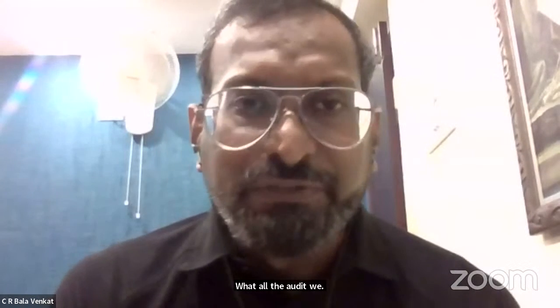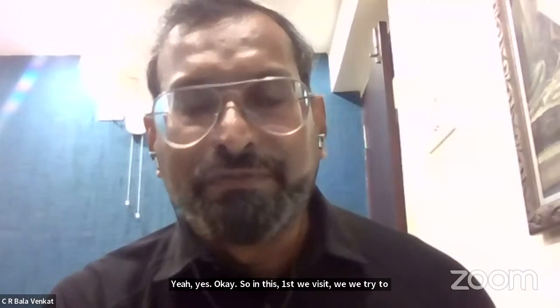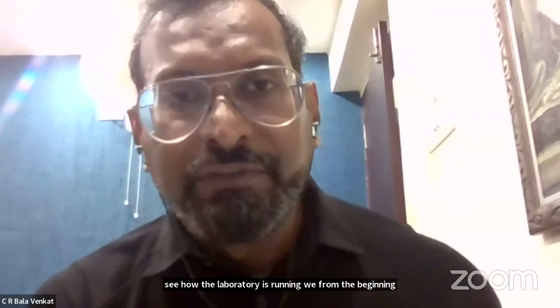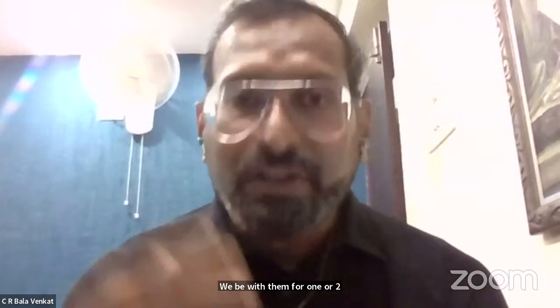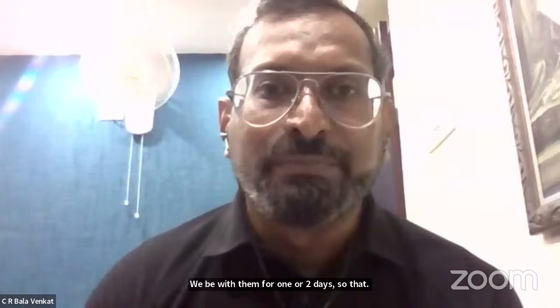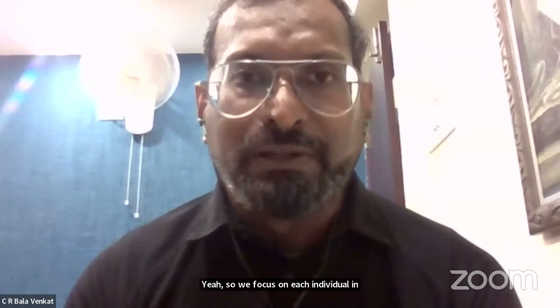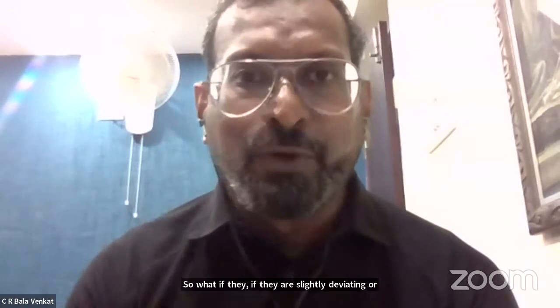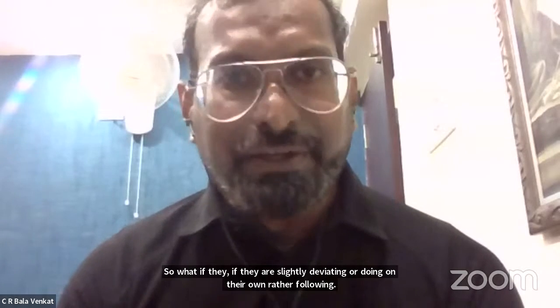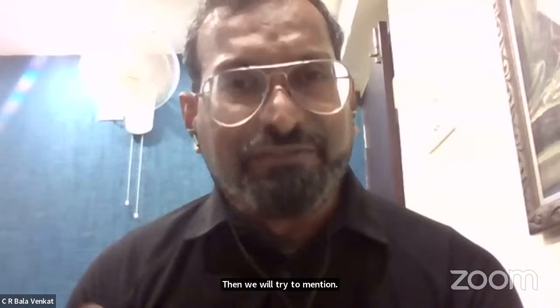So first we visit, and we try to see how the laboratory is running. From the beginning of sample collection, we stay with them for one or two days to see how they are working and what practices each individual follows. We focus on each individual in the laboratory. If they are slightly deviating or working on their own rather than following the norms, we will mention it, provide the correction, and advise what safety they have to follow.